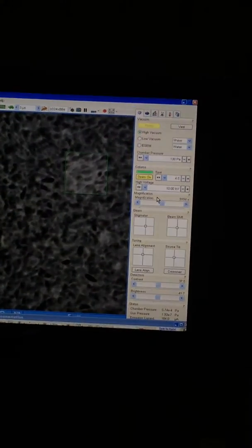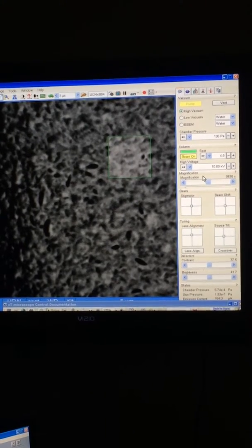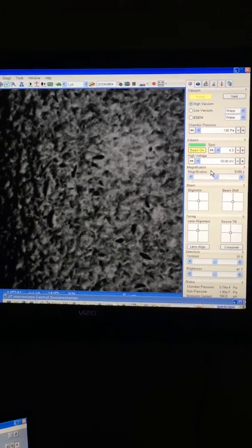So this picture right there is your best focus, but we can try to improve that by fixing the astigmatism. And now as we go through focus, it moves, but it's not distorting as much. So I've managed to correct the astigmatism to some extent, and I could spend more time with it, but that's not our purpose for being here.